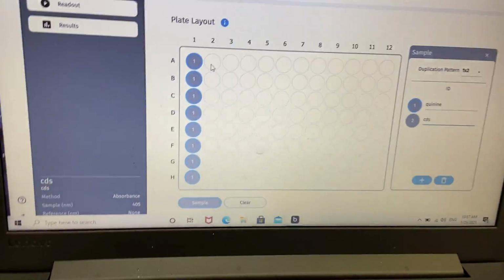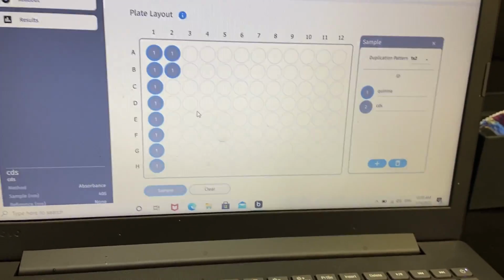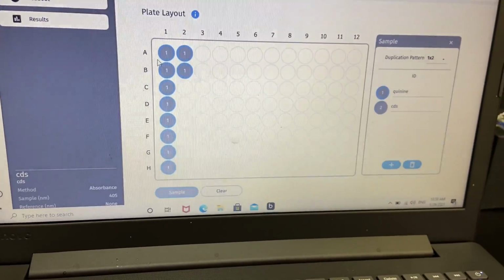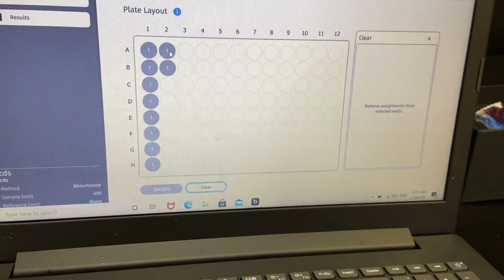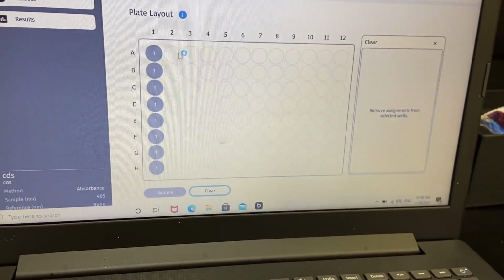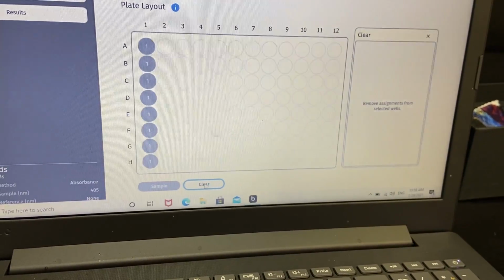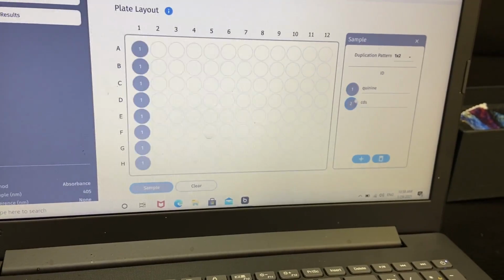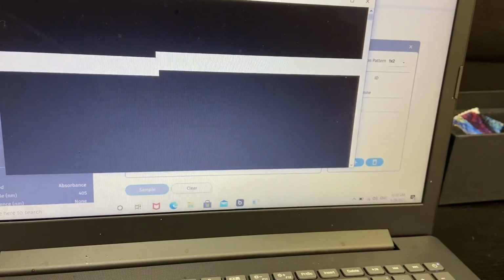And those samples are what I'm going to call CDS. And when I drag that, oops, sorry. See, I accidentally did that where this was still highlighted as 1. So what I can do is I can just click clear, and then I can go in and just individually select what I made a mistake on with this clear button. Go back to sample. What I didn't do was push 2 here. So you have to highlight it here, and now what I drag, or what is this?